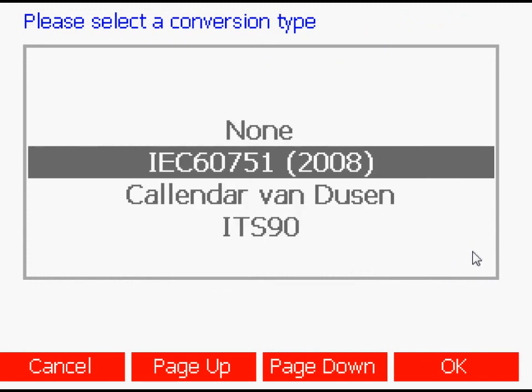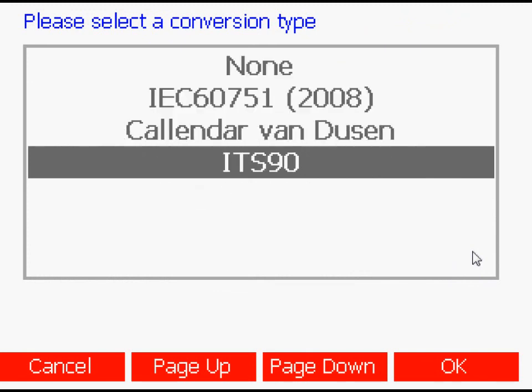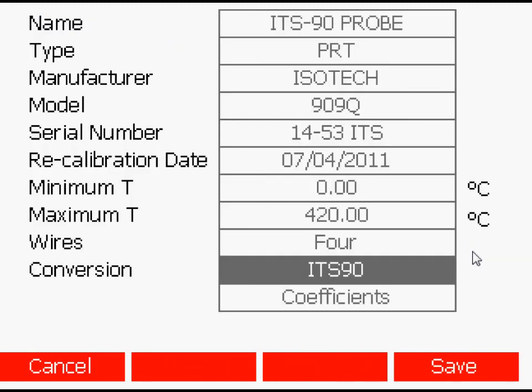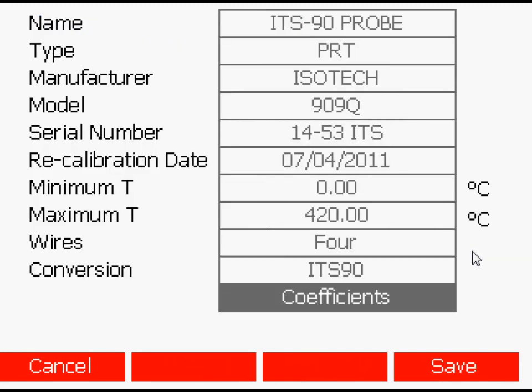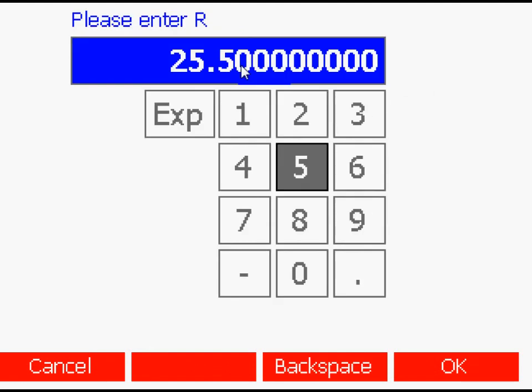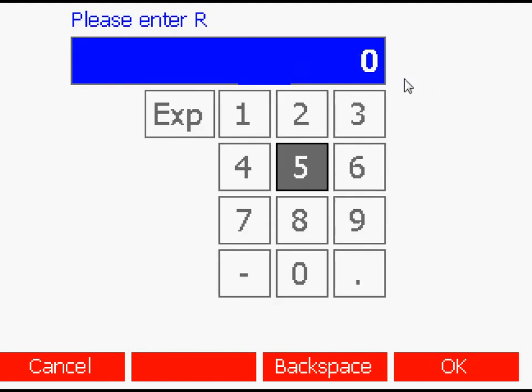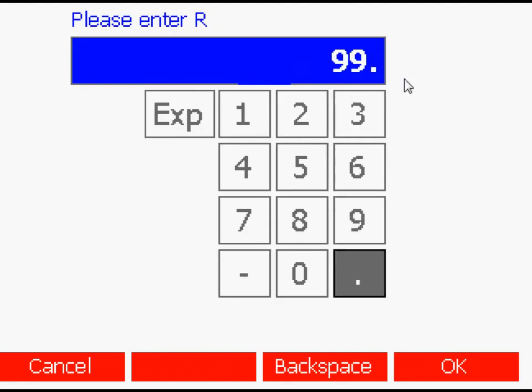The conversion type, and finally, the calibration coefficients as shown on the calibration certificate.